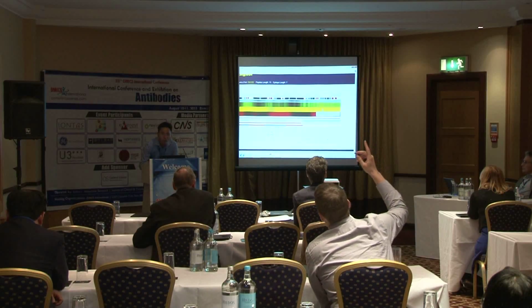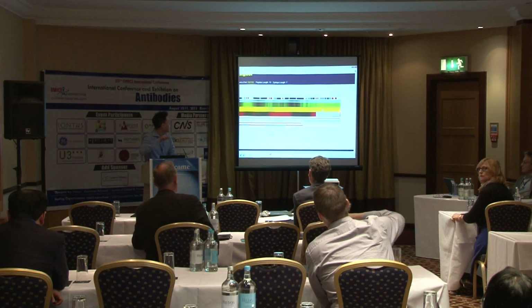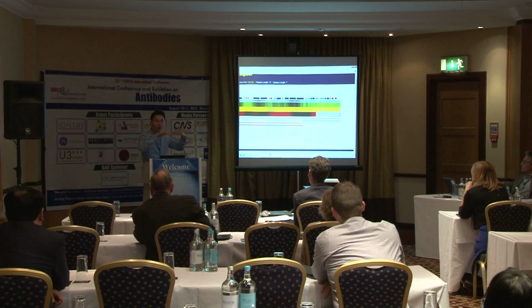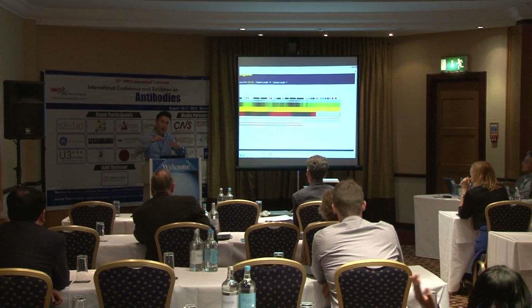You have a custom database in the background, right? Yes, so we have the database for the whole human. So basically, this is run against the whole species that you input. If you put in mouse, it will search against the whole mouse.